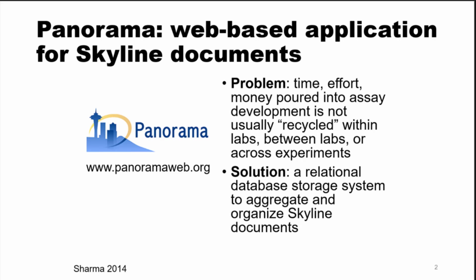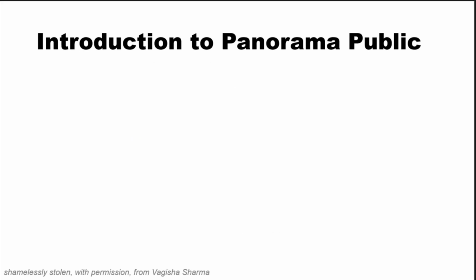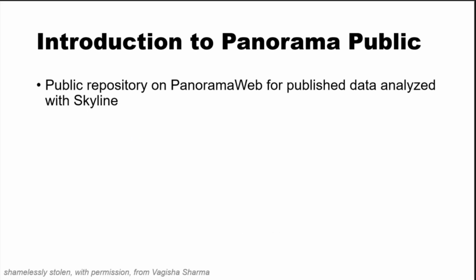We would develop these methods, refine them, validate them, do all of this data integration and data processing and annotate these files, and then they would just die on our desktops in our labs. So the idea was we should build a place to share these things so that everybody can learn from other laboratory science. So it's a public repository.